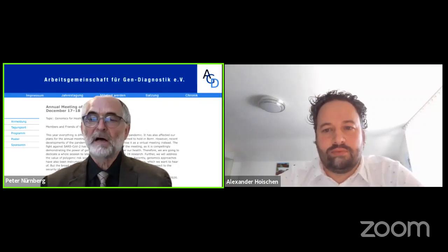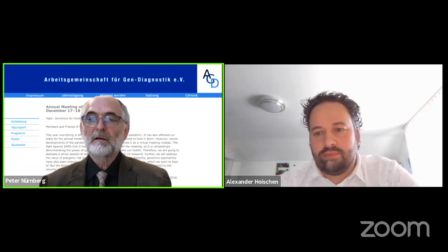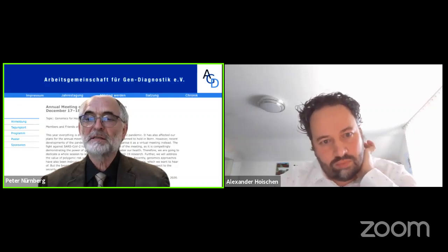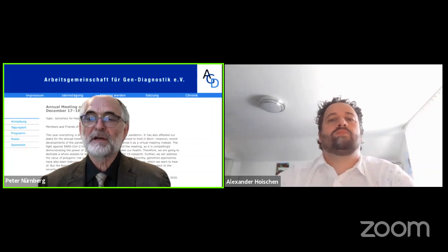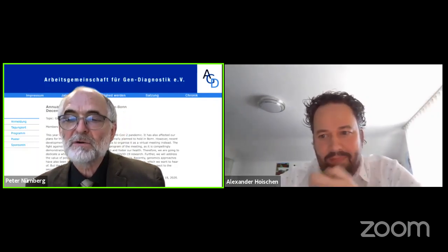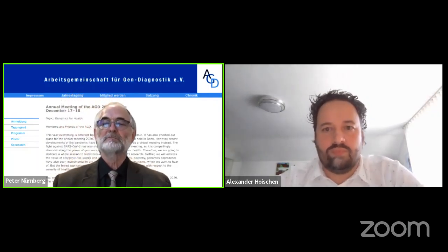So the last question comes from Mark Rauschendorf. Do you think you could get to the same resolution and quality with PacBio long read sequencing combined with Hi-C analysis of TADs in order to analyze structural variants and disrupted chromosomal domains? Seems this combination is already used at least for de novo genome assemblies.